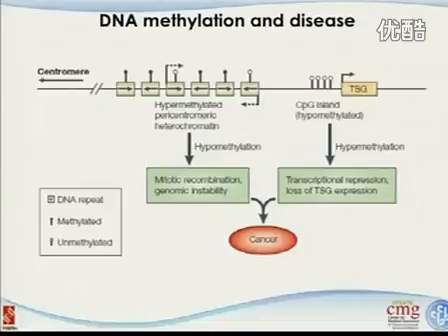Okay, and for this scenario, they have the real examples for all of those. Here you've got a tumor suppressor gene. And we can see this is hypomethylated. You can see this is a methylation site. If this is an empty circle, that is not being methylated. It's a potential methylation site, but not being methylated.